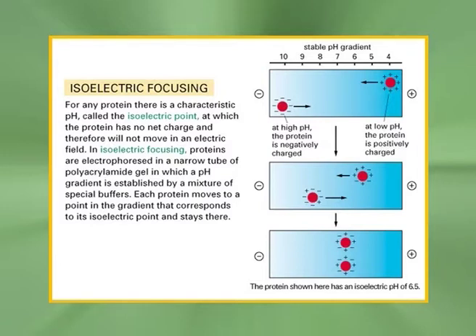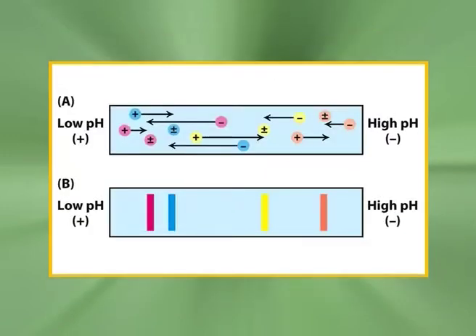A polyacrylamide gel containing these ampholytes is connected to an electrophoretic apparatus that contains a dilute acidic solution, that is H+, in the anode chamber and a dilute basic, that is OH-, solution in the cathode chamber. When voltage is applied to the system, the current flow will be largely due to migration of the charged ampholyte species present in the gel.